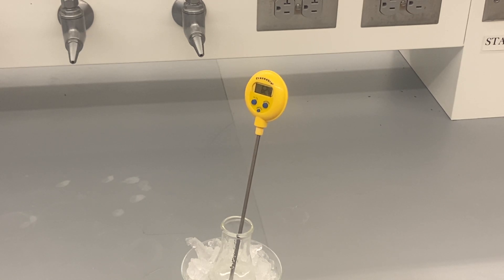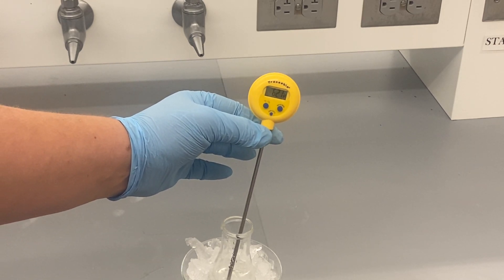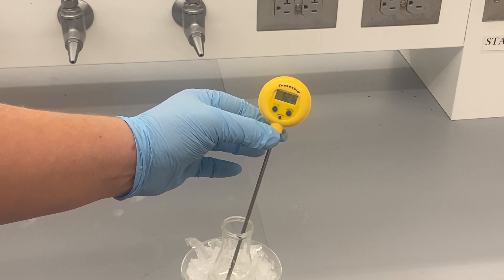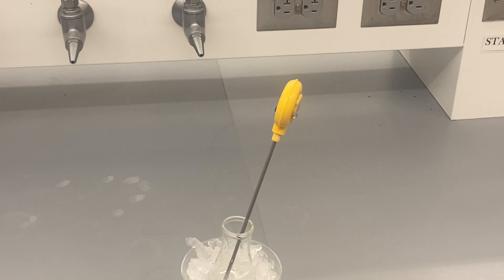And that's going to continue to taper off over the next several minutes. Ice bath is really simple. It doesn't present as many potential dangers — usually you're not working with extreme temperatures in the way that a hot plate or anything involving a Bunsen burner can pose.